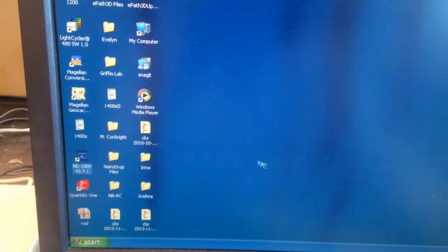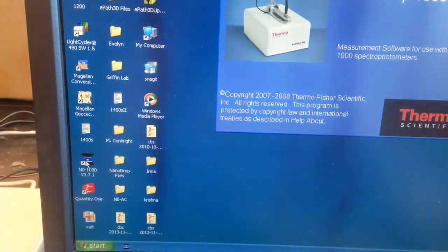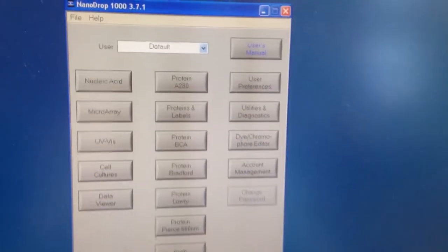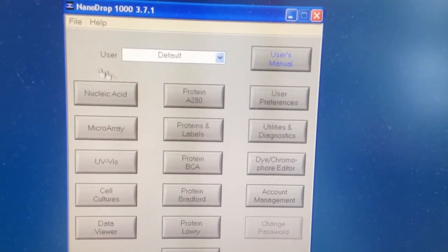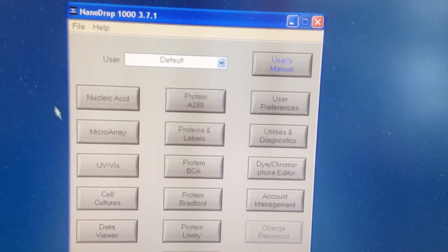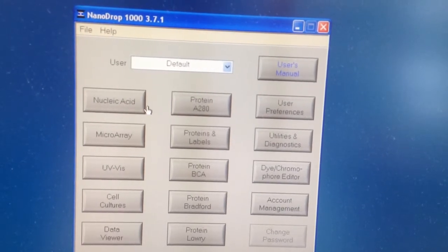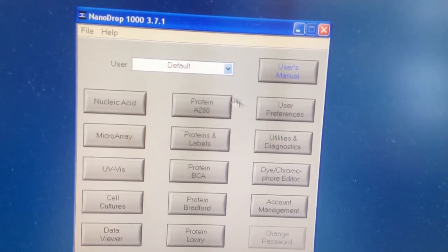We are going to go ahead and open up the software program to initialize the machine. For demonstration purposes, I'm going to focus on the nucleic acids. Obviously, you can do a multitude of things with this machine, but some of you are probably wondering if this video is ever going to come to an end, so let's get going.